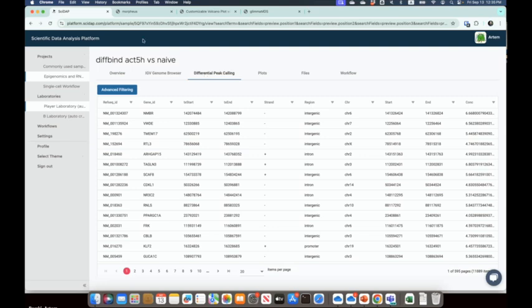Based on this, you can create lists of peaks, which can be inputs, for example, for motif analysis, or to build various heat maps and plots. Okay. Do you guys have any questions about the bulk data? If not, then I will move to single cell data analysis.